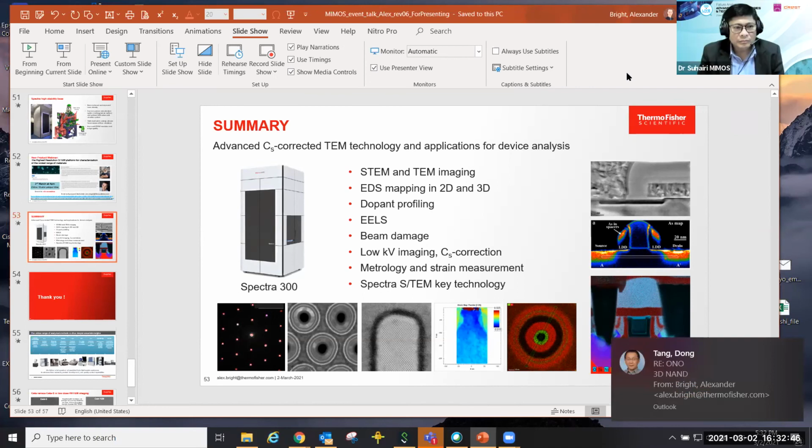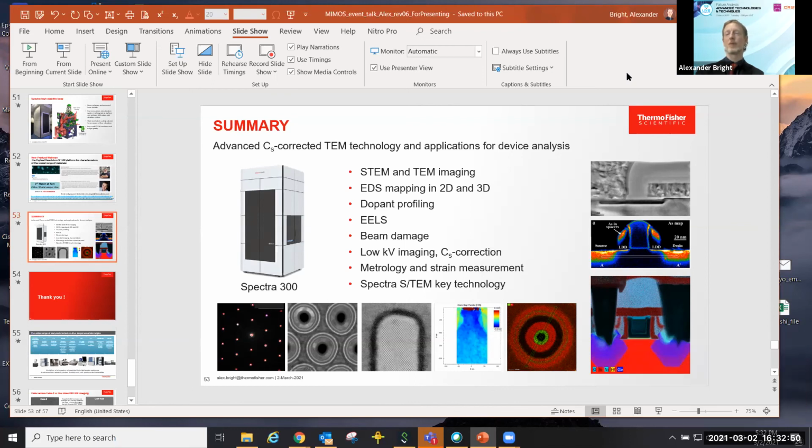If you can do that, then it makes our lives much easier when installing the microscope, and I think in most cases you'll get better results. So it is not advisable to have it in a multi-story environment, for example, as third floor of a building. I think systems are more stable than they used to be in a variety of environments.